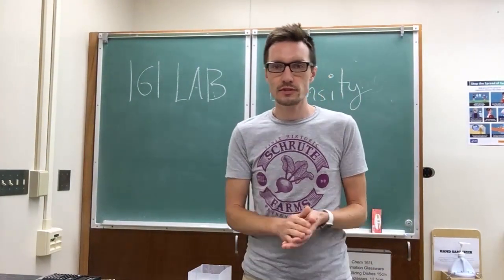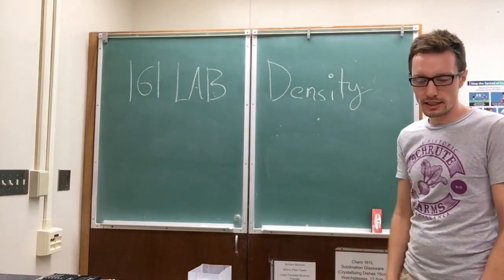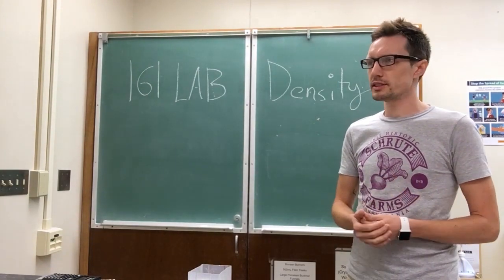Everybody, Jesse here. We're going to do our 161 lab on density. It's going to be really quick because I'm only really taking maybe a couple of measurements.